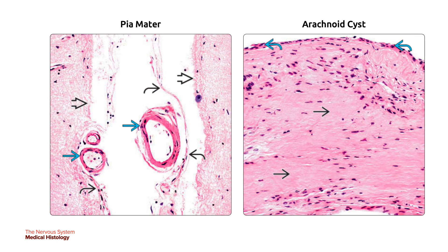The pia mater on the left is the delicate membrane that coats the brain surface as well as penetrating cerebral vessels. The potential space between the pia mater and the CNS surface is called the sub-pial space. On the right, arachnoid cysts are usually congenital and asymptomatic. The arachnoid is replaced by dense fibrosis, but the characteristic overlying single-cell layer of mesothelium is still visible.